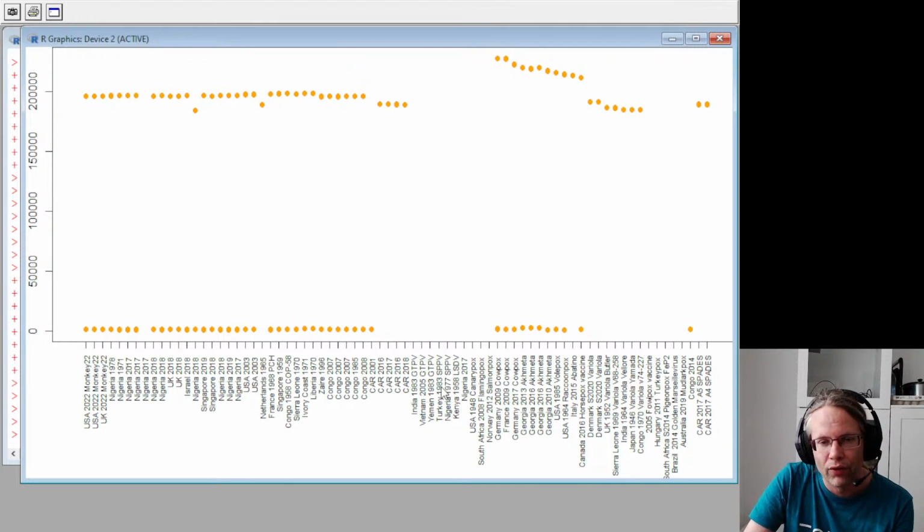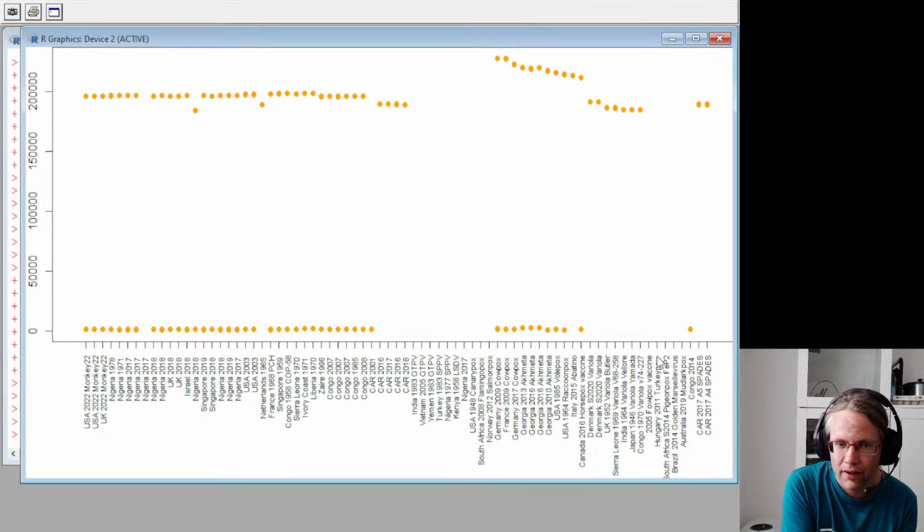If we then look at all of these here, these don't seem to have any copies of the gene. So these here are the Indian, so the goat variant of monkeypox. Right, so this is goat pox. Goat pox doesn't have this gene at all. And we see that the same thing holds for some of these other entries here, which are like the turkey pox and the ones from Marseille. And so the bird version of the genome does not have this gene.